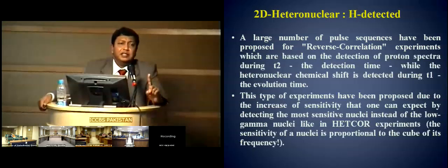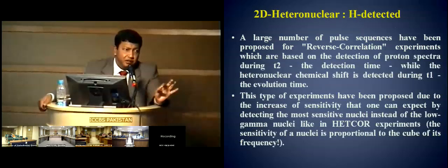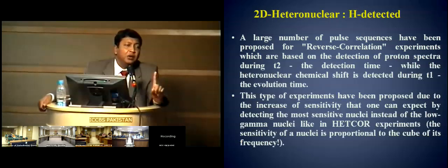Mixing time is a constant. It is not varied. Always remember, these 20, 40, 50, 60 that I am telling you are constant for a set of experiment. That is why I say I don't want to confuse you with evolution time. TOXI with 20 millisecond is altogether a separate set of experiment.